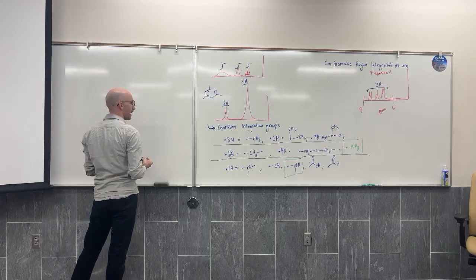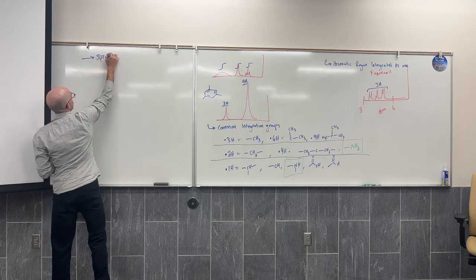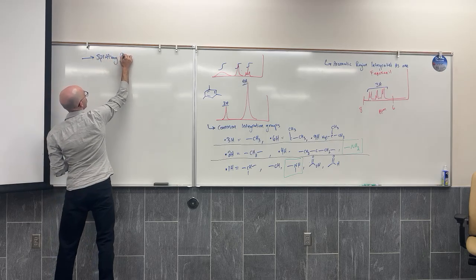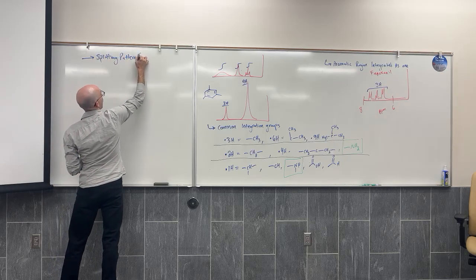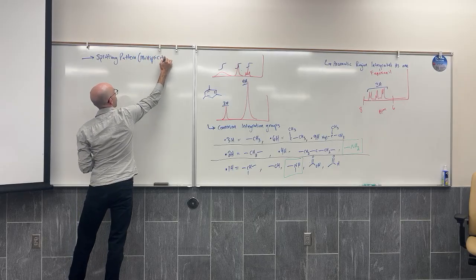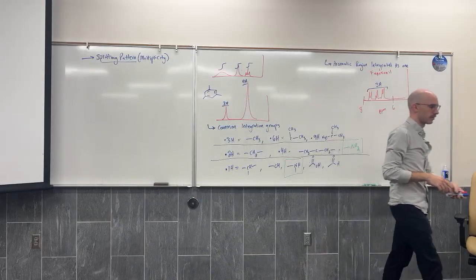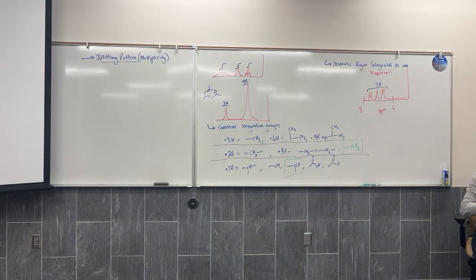All right, our last component is called splitting pattern, also referred to as multiplicity. Why does a signal appear as more than one peak?